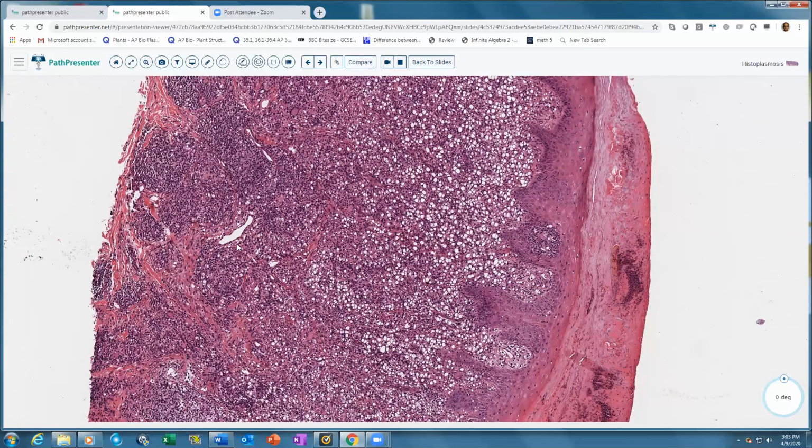And then obviously if you're in practice, you're going to do the stains. Histoplasma is a fungal organism, so it is easy to make the diagnosis because it will stain with the fungal stains, and the Leishmania is going to stain with the Giemsa stain. It will not stain with the PAS or the fungal or the GMS stain.